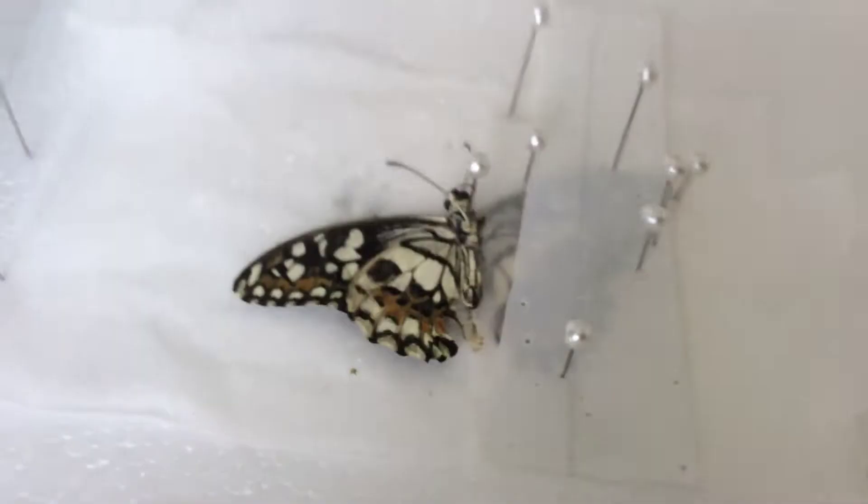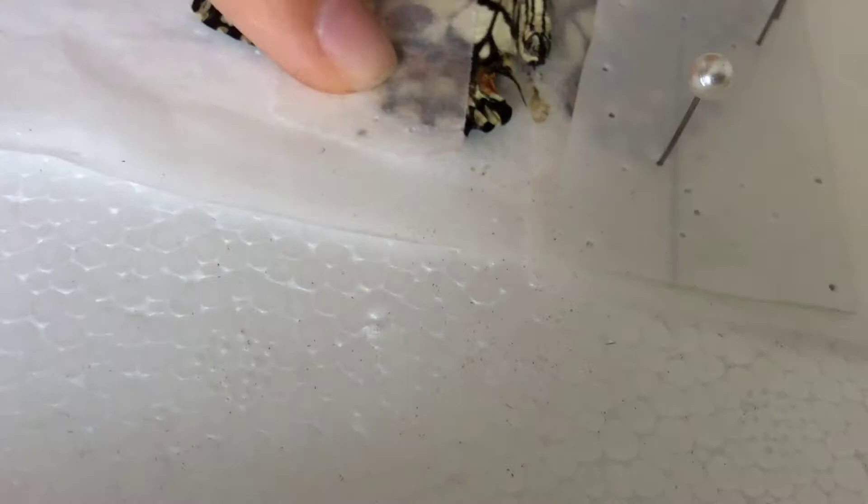So, the first thing you're going to want to do is take your parchment paper slide and place it over the wing. Then you're going to want to pin your parchment paper slide in place. After that, you're going to leave half open and carefully adjust your butterfly's wing until whatever shape you wanted.